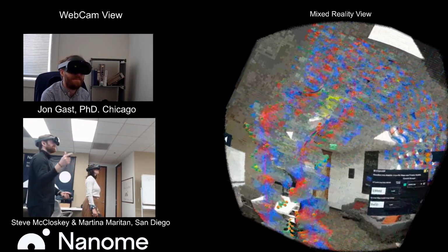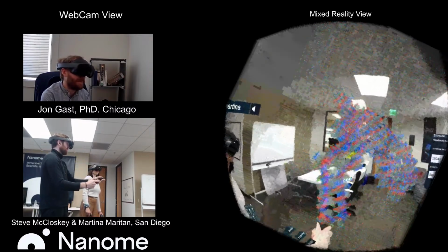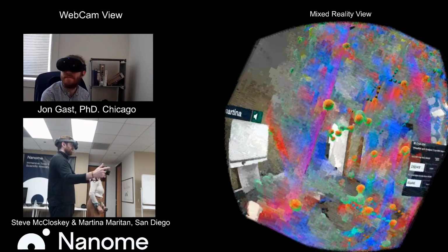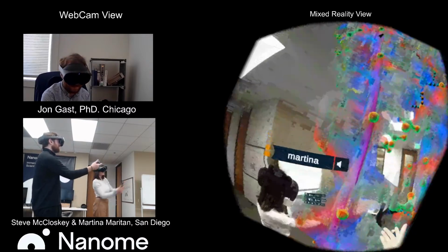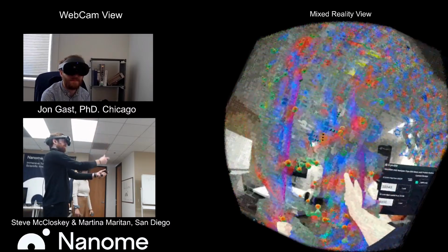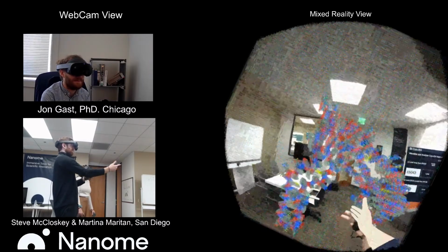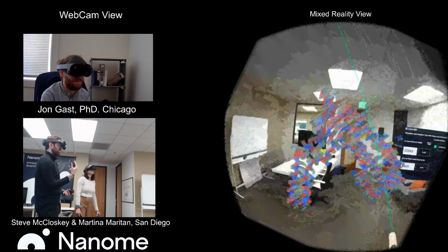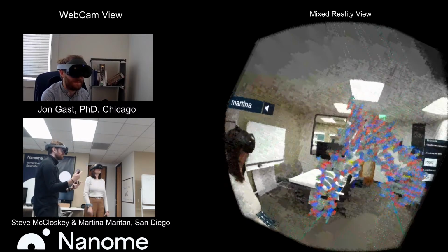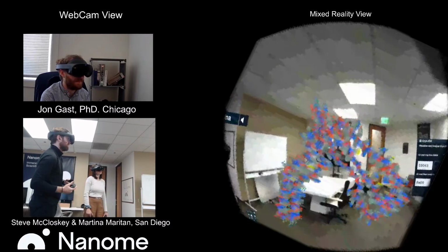But thank you, audience member, for asking about that. It's always great to walk around the structures, or zoom in and be inside the structure. So there's many different ways to visualize and interact with these structures. I just have a personal preference for it being maybe a little bit smaller than me, and being in that arm's distance area, because it looks really good in stereo. But again, since you're all watching this on the stream in 2D, things are going to look a little bit different. So I want to make sure that you all have a really great view with it too. Nice.